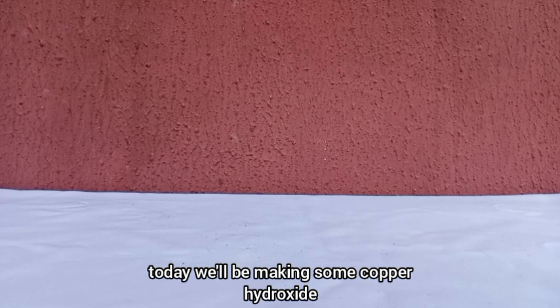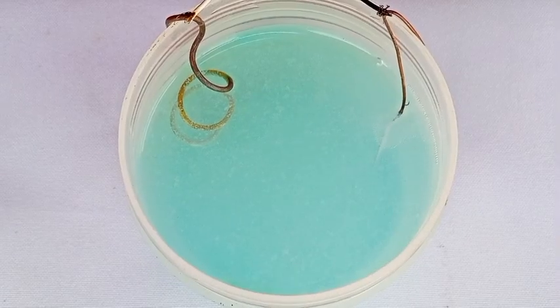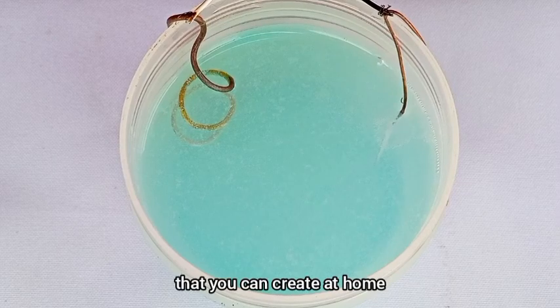Hey aspiring chemists, today we'll be making some copper hydroxide, a beautiful blue compound that you can create at home.